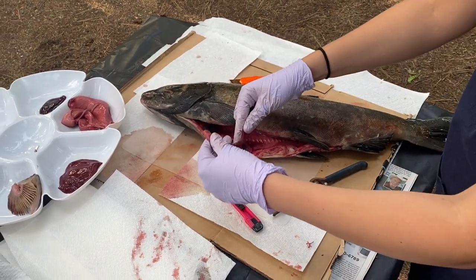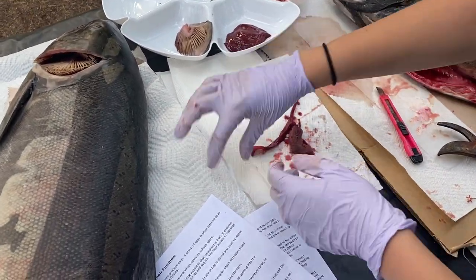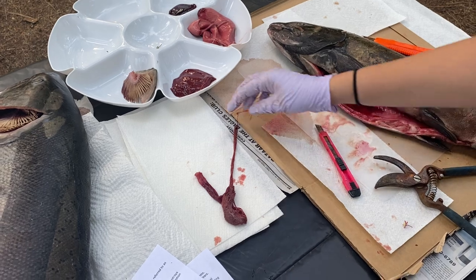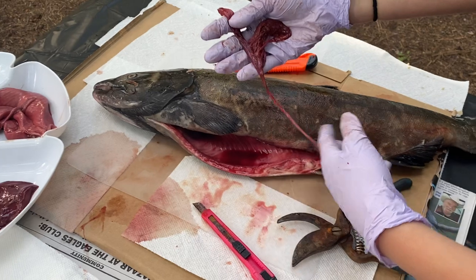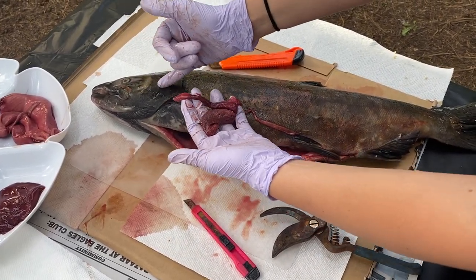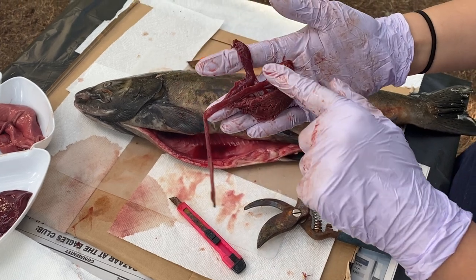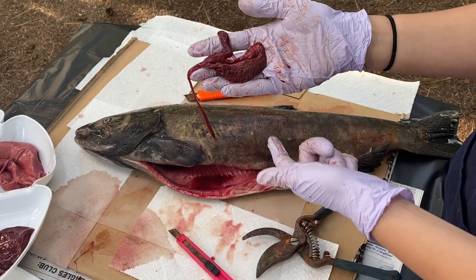So here we have the whole digestive tract of the salmon, and it looks really, really small. And it starts here. We'll try to lay it over here so we can see it. So this was her esophagus, or his esophagus. And so he would eat food, it would go through those gill rakers and go down the esophagus. They're going to travel inside the stomach, which is pretty nuts to think that this right here is the salmon's stomach. It's so, so tiny, but these guys have not eaten since they hit fresh water.